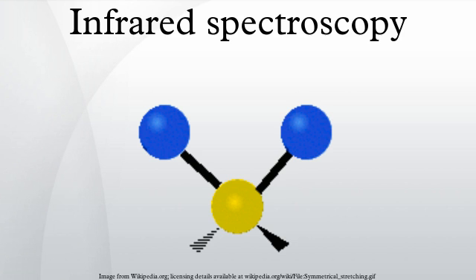Analysis of the position, shape and intensity of peaks in this spectrum reveals details about the molecular structure of the sample. This technique works almost exclusively on samples with covalent bonds. Simple spectra are obtained from samples with few IR-active bonds and high levels of purity. More complex molecular structures lead to more absorption bands and more complex spectra. The technique has been used for the characterization of very complex mixtures. Spectra issues with infrared fluorescence are rare.